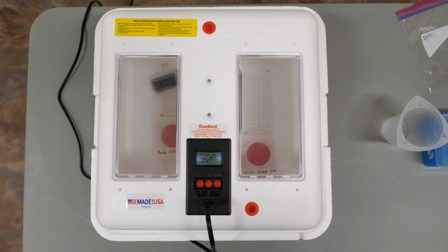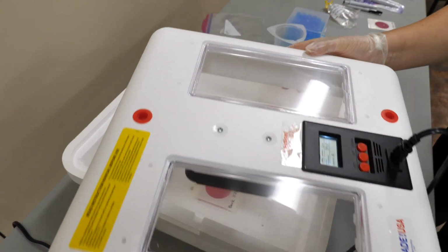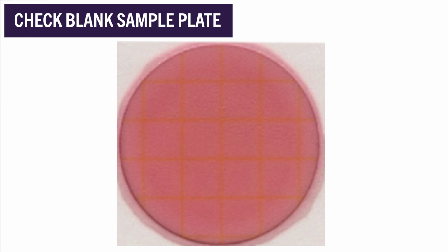After 24 hours, it's time to read the results. Wear gloves to remove the plates from the incubator and examine each plate individually to count bacteria colonies. You'll first want to check your blank sample plate. There should never be any blue or red dots or bacteria colony growth on your blank plate. If there are, you must not submit this stream E. coli data to the database, as these results are considered invalid.